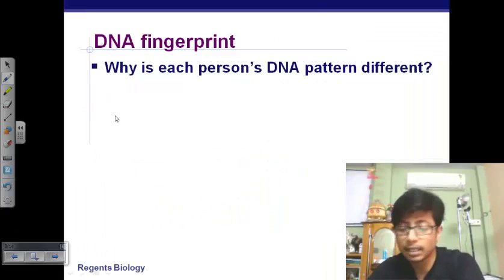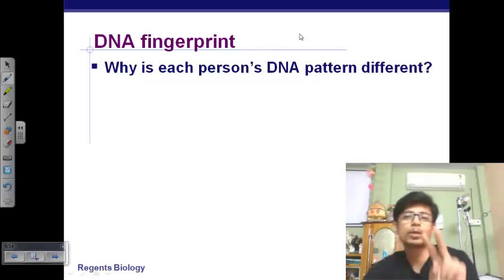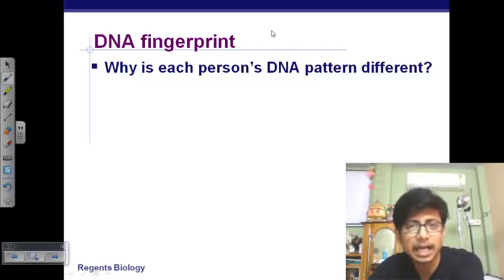So now the thing is, when we apply all these things, how we apply this DNA, I mean gel electrophoresis. If you ask me when we use gel electrophoresis, I'll tell you where not. In all the different techniques of biology, we must have used this technique. There are two important techniques in molecular biology we can't get rid of. One is gel electrophoresis, another one is PCR, or polymerase chain reaction, because they are the foundation of molecular biology and cell biology analysis.